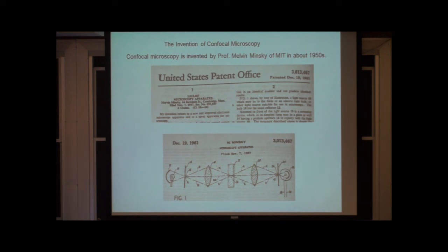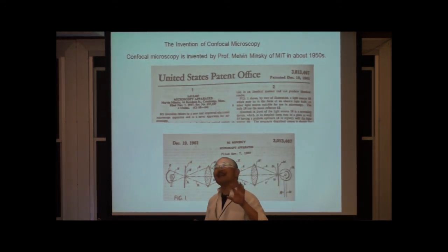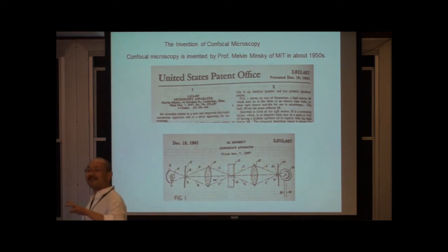And confocal microscopy did not become commercialized until the 1980s. So one of the questions is, why didn't Professor Minsky's invention work? How many of you have used a confocal microscope before? Quite a few. And certainly after today and tomorrow, most of you, maybe not everyone, will have a chance to use a confocal microscope.